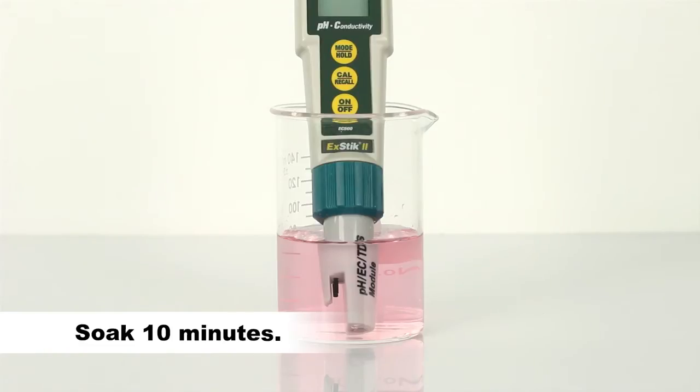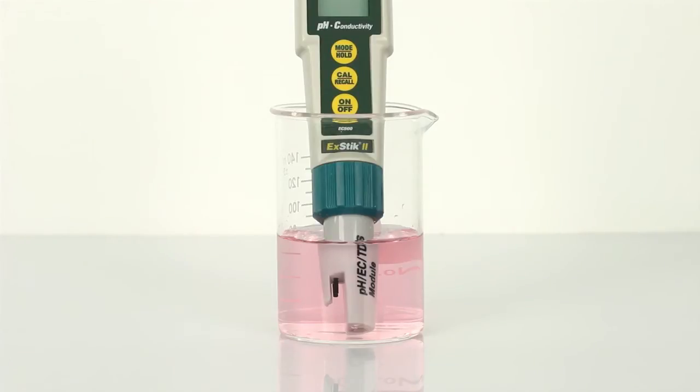White potassium chloride crystals may be present in the cap or on the electrode. This is to be expected depending on the length of time in storage. These crystals will dissolve while soaking the electrode, or they can be rinsed away with tap water or distilled water.